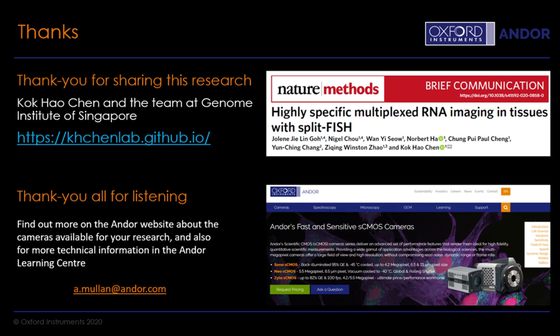Thanks, Jamie, for the question, and it's a very good question. One of the motivations for developing this spatial transcriptomics is to look at FFPE tissues, right?